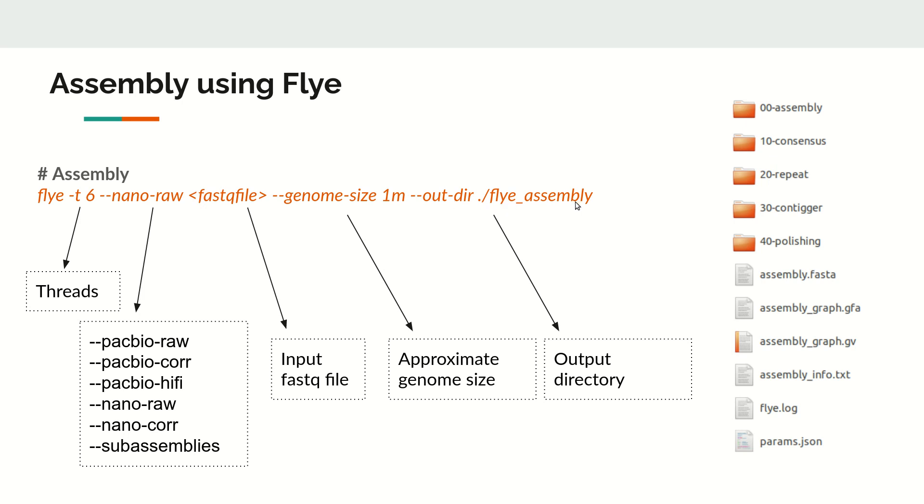Once this command finishes, the results will create multiple folders like assembly, consensus, repeat, contigs, polishing, doing end to end. At the end, it will generate the FASTA file in the form of assembly.fasta which will contain the contigs.